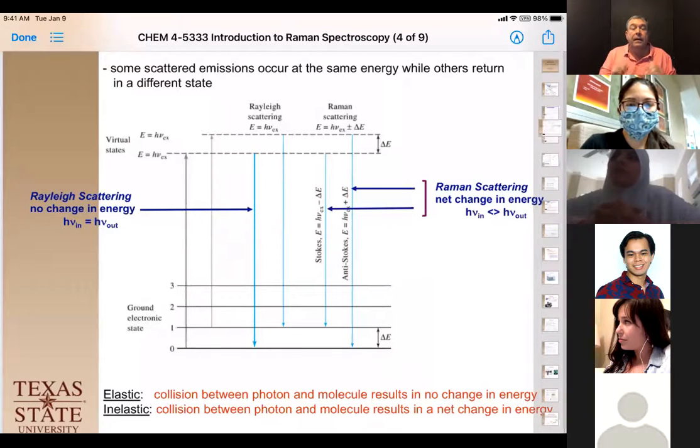Now if the scattered light from the system has a different energy than the excitation energy, then it can be higher or lower. And we call that inelastic because it's not exactly one-to-one, it's one minus something or one plus something. That difference in energy comes from which energy band they're relaxing back to during that emission. So elastic is the Rayleigh scattering, and that's okay. But Raman is the one we can actually measure these different functional groups with in that IR frequency band.